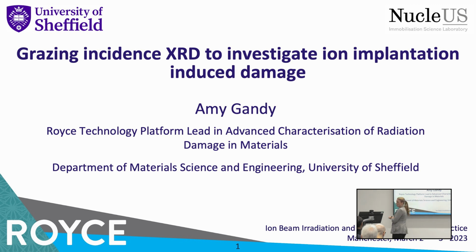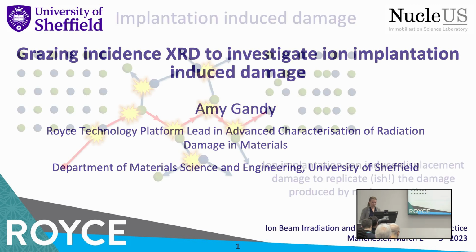So today I'm going to talk to you about one of these characterisation methods, which is using X-ray diffraction in what we call grazing incidence mode. And this is specifically then to look at ion implantation induced damage in our materials.